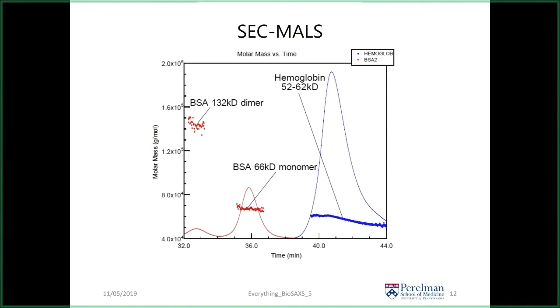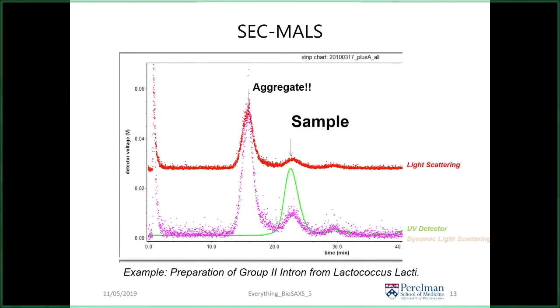Here's an experience I had with a Group II intron. By UV you always see a nice single peak — but what we never saw unless we ran SEC-MALS was a massive amount of aggregation accompanying that sample. We learned from this experiment that we had to spin-filter or pre-size the particle before doing our scattering experiment. Like cholesterol, you can't see it, it's there, it's killing you. Sizing is a very important step in preparing your sample for light scattering analysis.